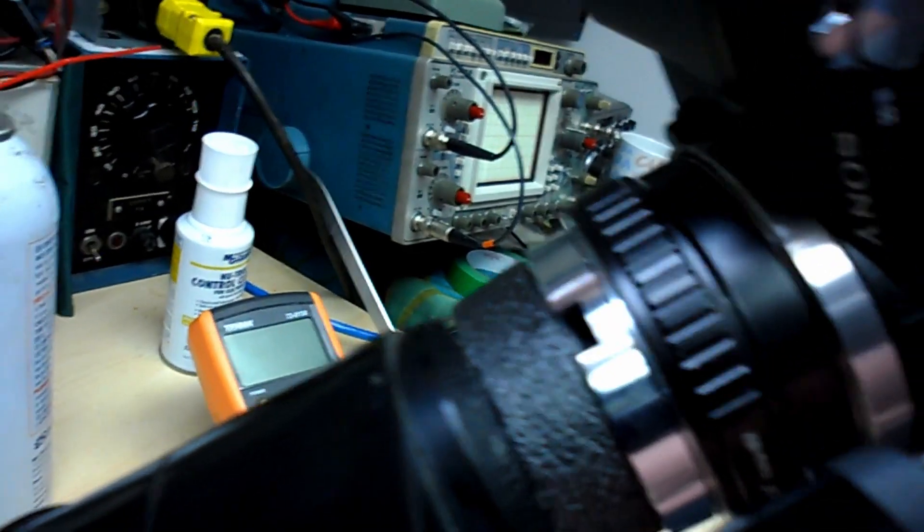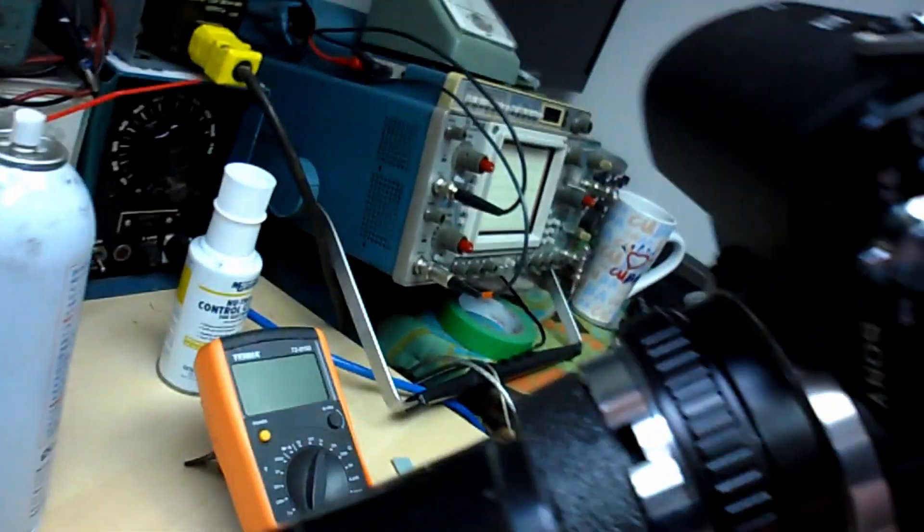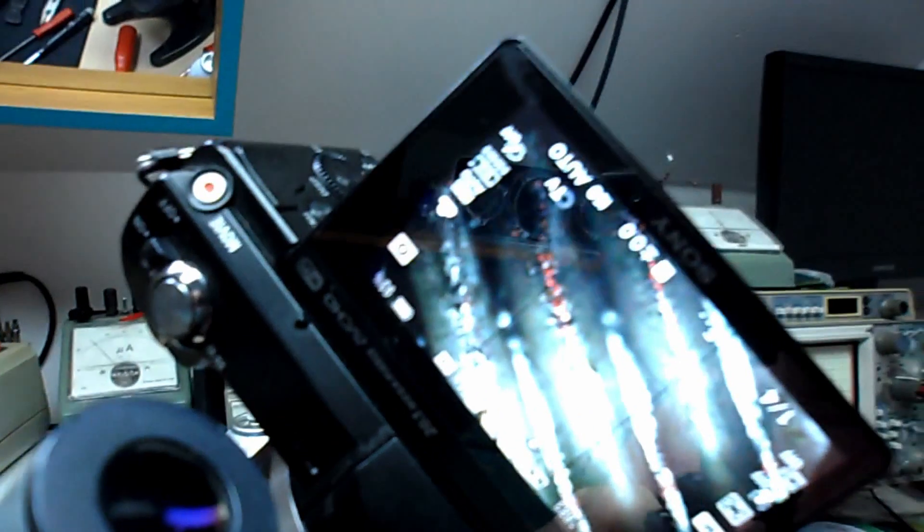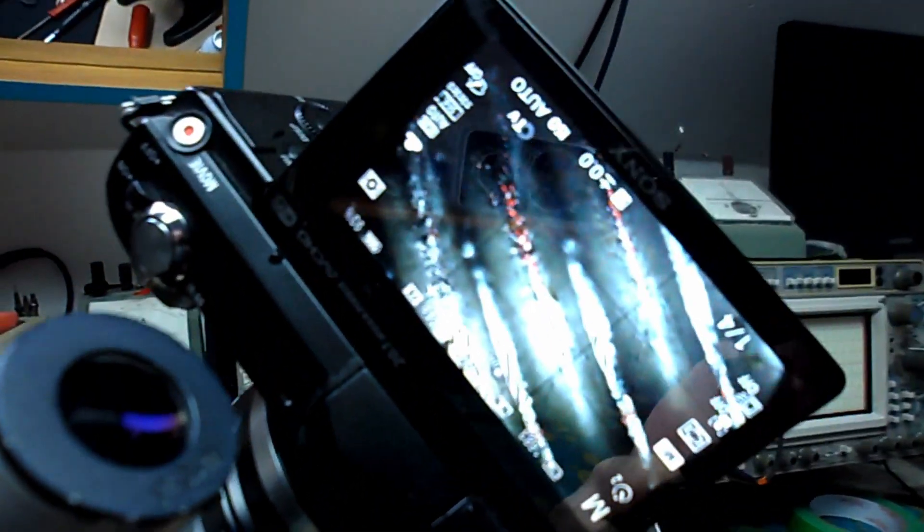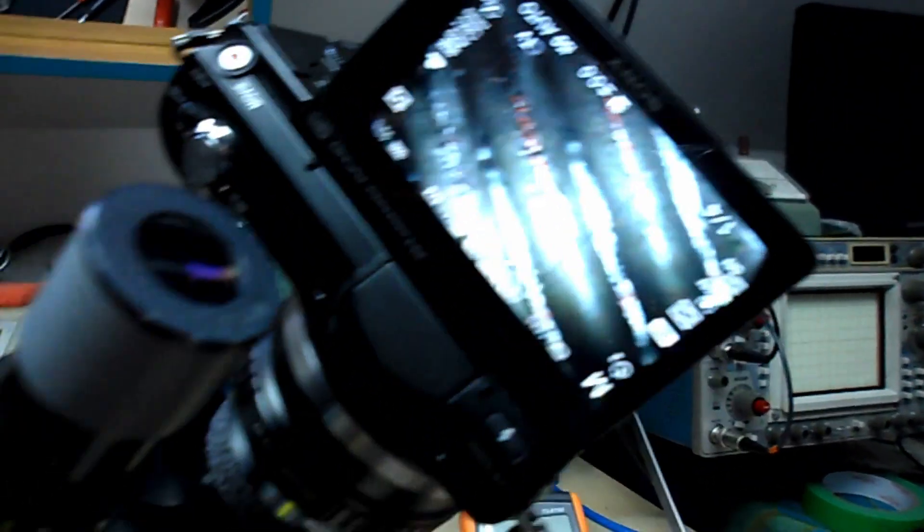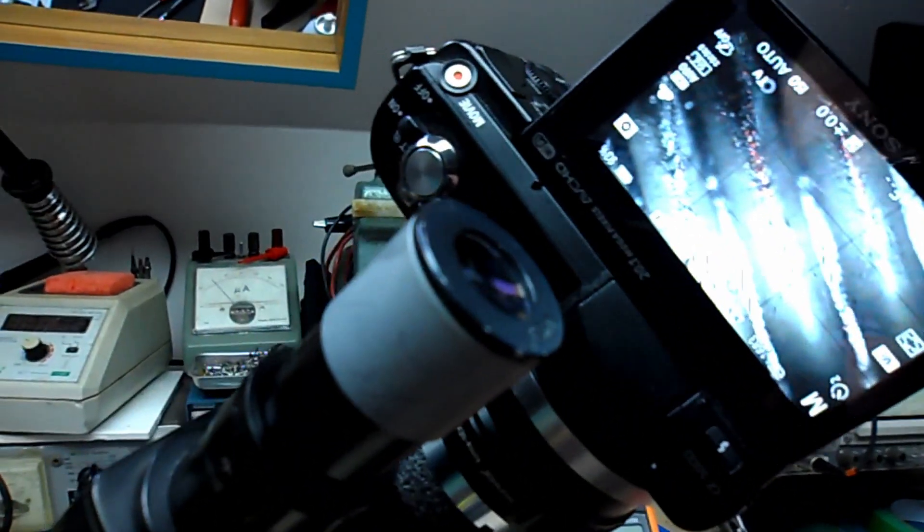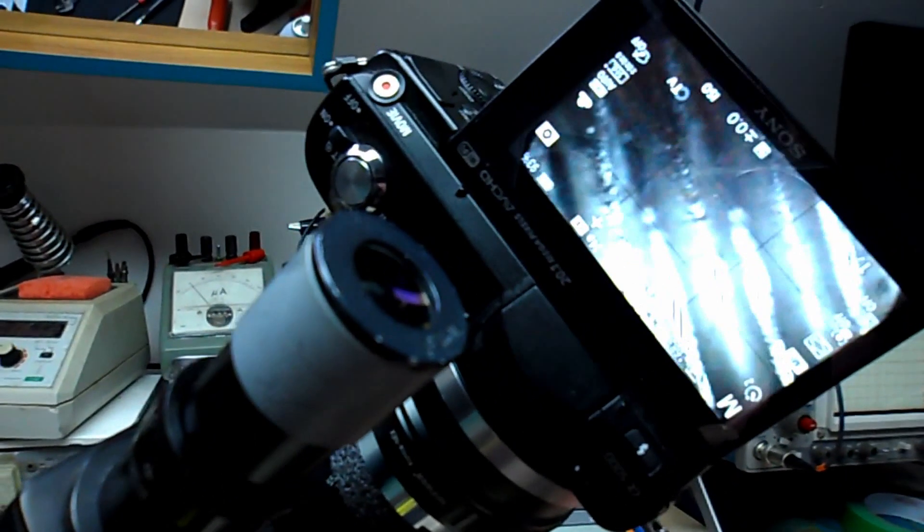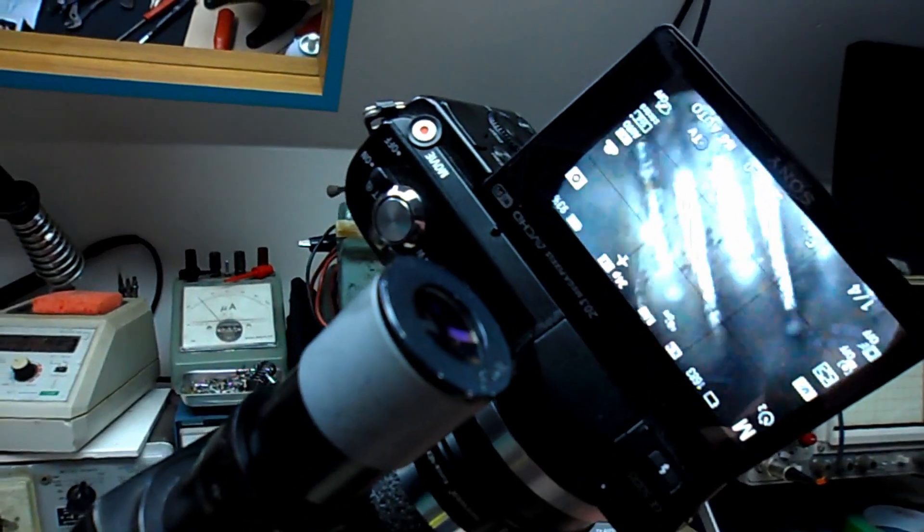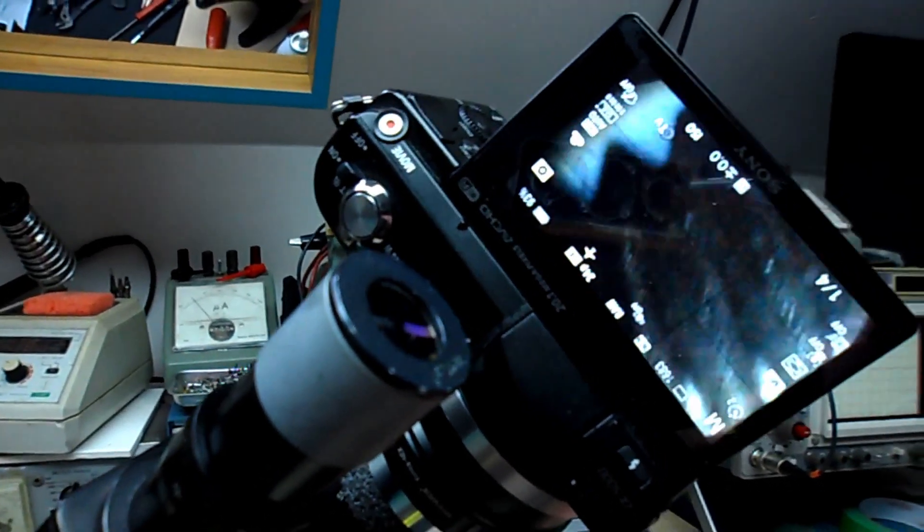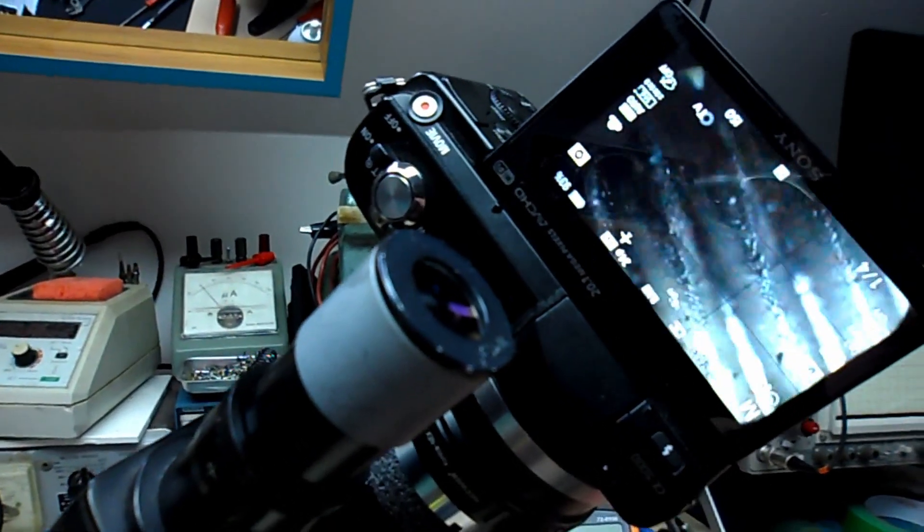I'm kind of happy. I mean it holds the camera in place and I'm getting a nice image, so that pleases me. I know that I could go out and buy, well no, here's the thing.